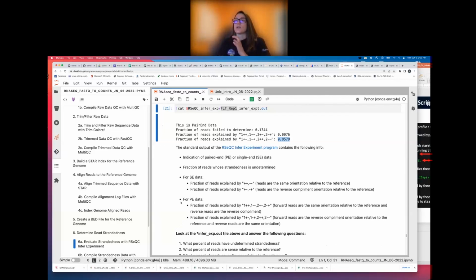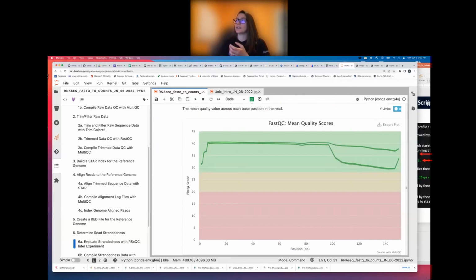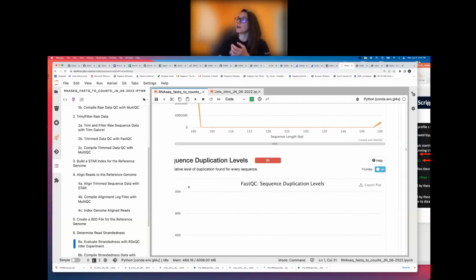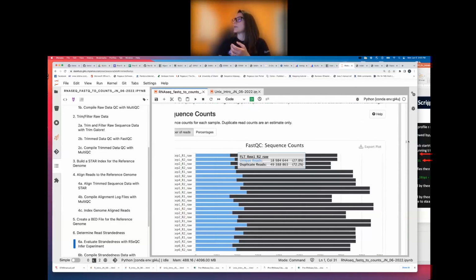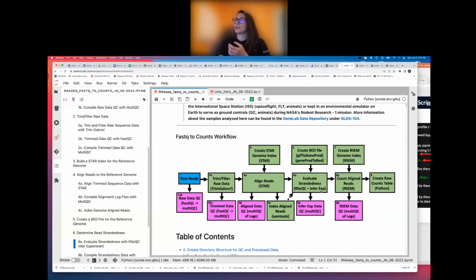I do want to let you guys know, if you want to stay on and play around with this a little more, if you want to rerun any of it above, you're more than welcome to. Just to give you a heads up where we are in the pipeline here before we sign off. You just go all the way to the top. We right now are in this step here, so we just evaluated strandedness. And so we're going to take a look, compile that information again with MultiQC first thing tomorrow, and take a look at the strandedness of our data. And then we'll be moving on to quantitation, which is the last step in this Jupyter notebook.